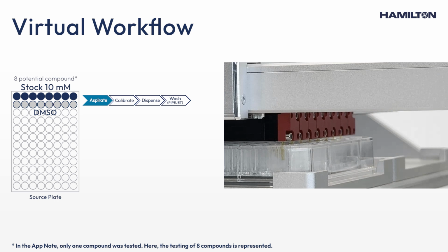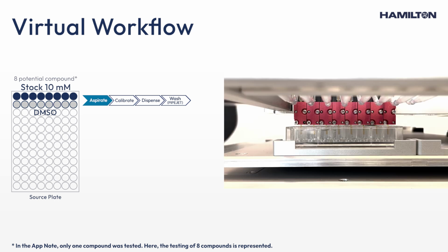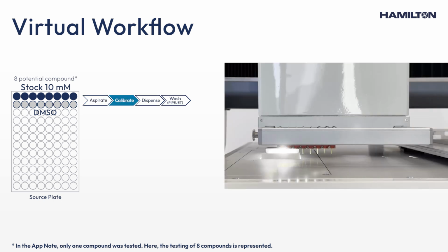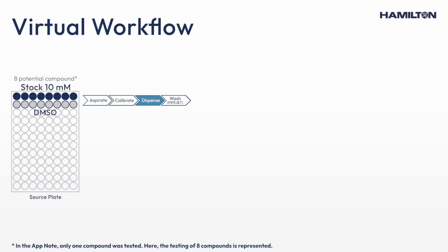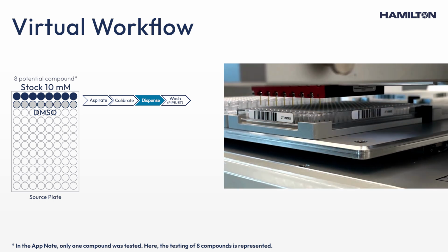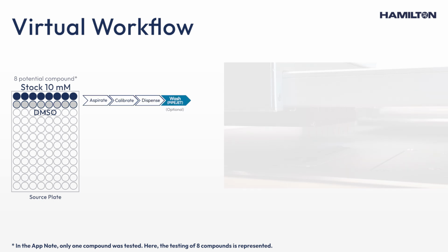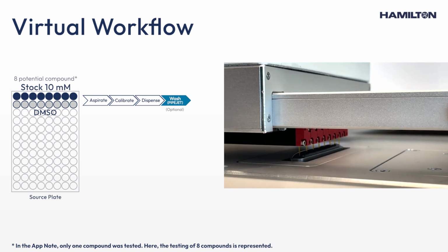1. Aspirate. 2. Calibrate with the Smart Drop to adjust the parameters of the drop volumes needed for each reagent. 3. Dispense using the non-contact pipe jet technology. And 4. Wash the pipe jet to clean the pipes and avoid contamination.